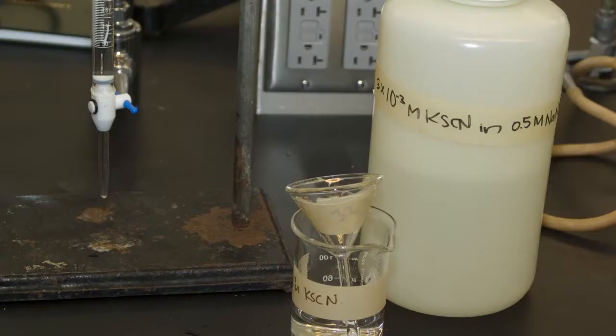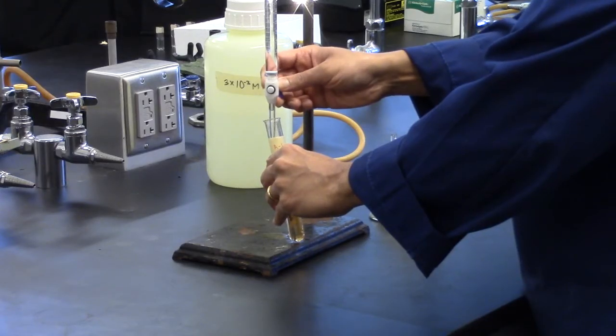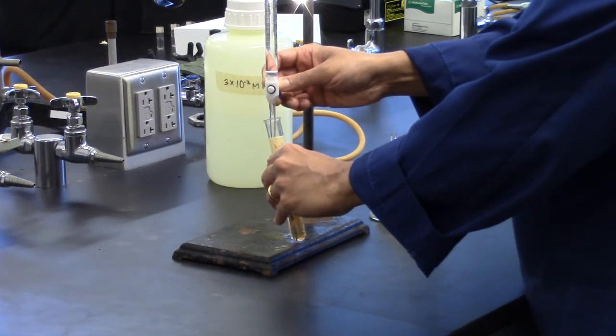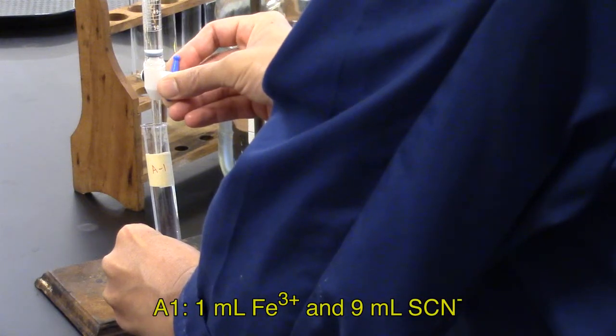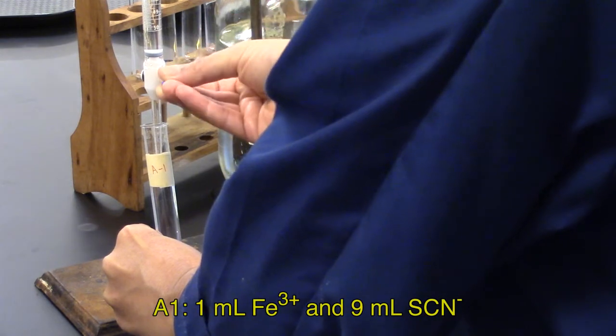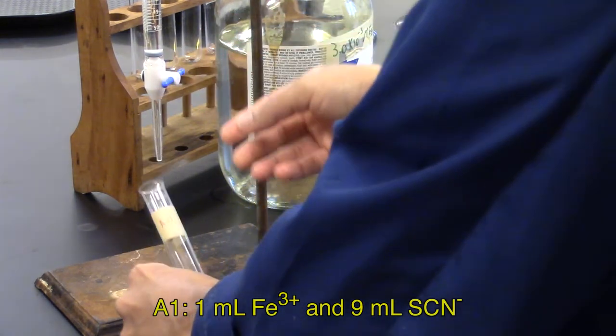and the other has 3.0 times 10 to the minus 3 potassium thiocyanate. Use medium-sized test tubes for the solution. Five different samples are listed in this table. Use burettes to measure the appropriate amounts of iron-3 and thiocyanate.